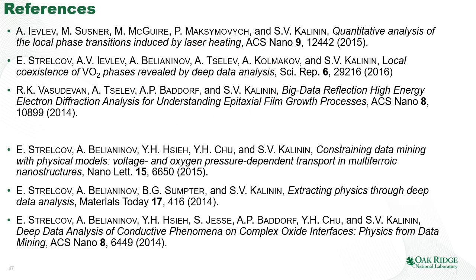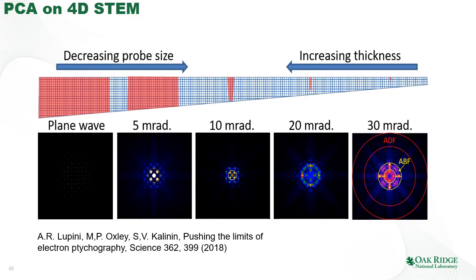They represent the use of Bayesian unmixing for different types of problems, ranging from phase identification in metal-insulator systems, beam-induced phase transitions, applications for techniques such as high-energy electron diffraction in epitaxial growth processes, and so on and so forth. What else can we do?